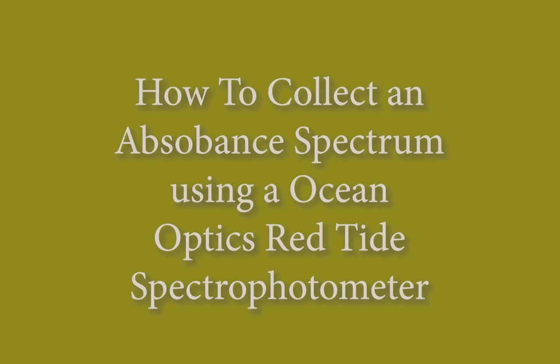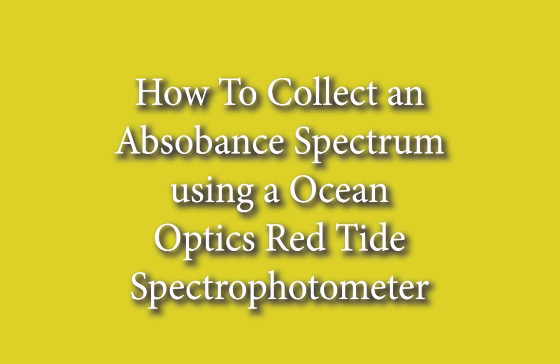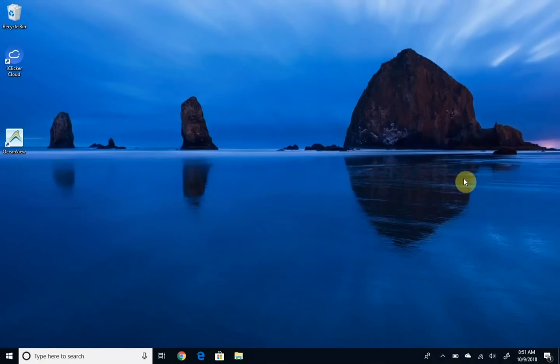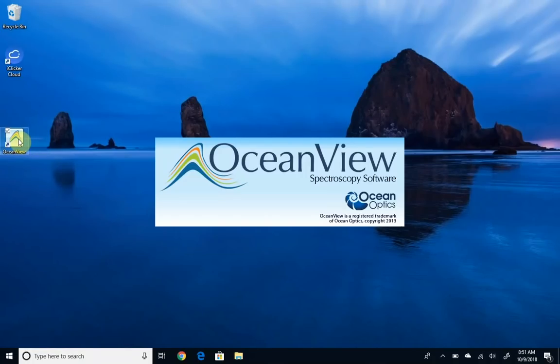Hello, in this video we're going to go over how to use the OceanView software to collect an absorption spectra with the Red Tide spectrophotometer. Your screen is going to look a little different than mine, but you should be able to find an OceanView icon somewhere on the left side. Double click on it.